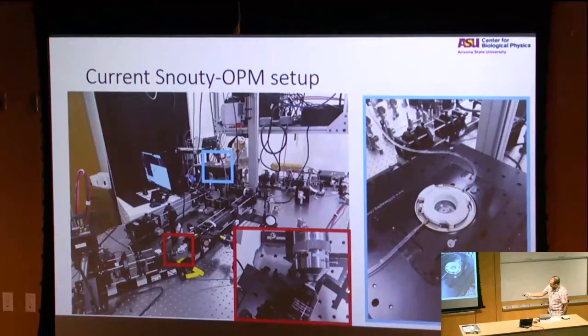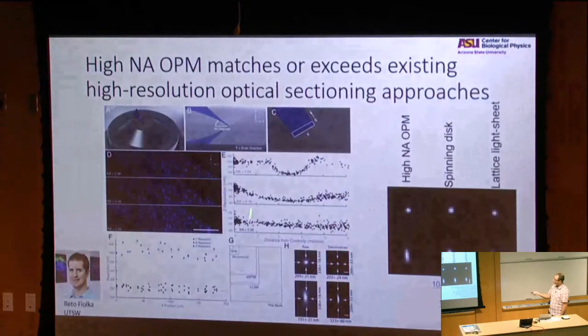Here's that remote refocus. I hope everyone can appreciate this is very close. My students really don't like aligning it, so it's roughly 100 microns away. And then the rest of this is just laser launching and, you know, dealing with the steering, right? Here's the proof is in the pudding.